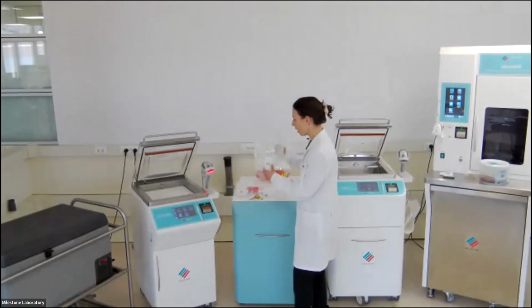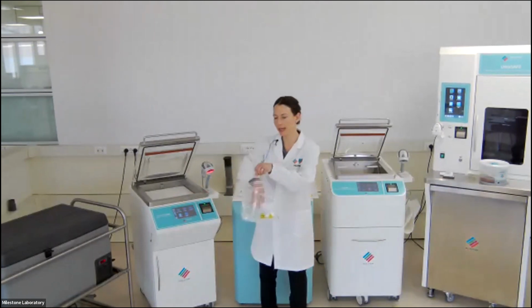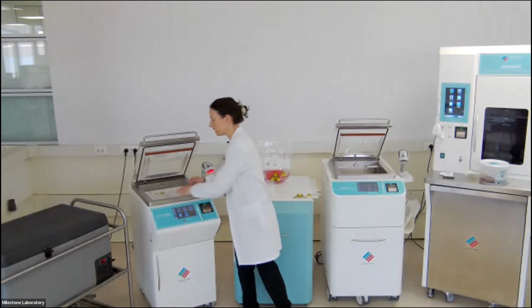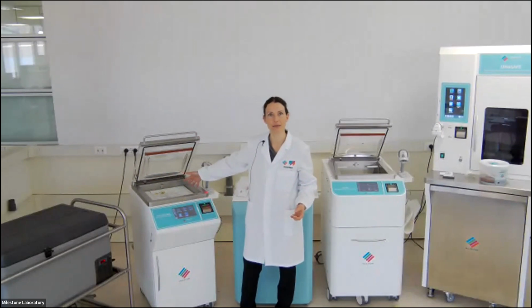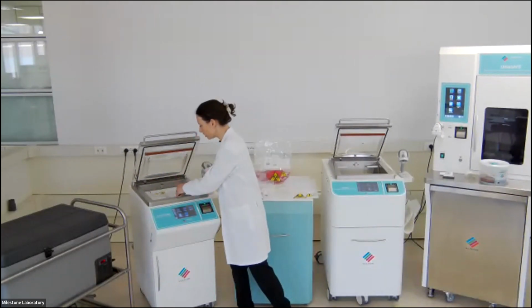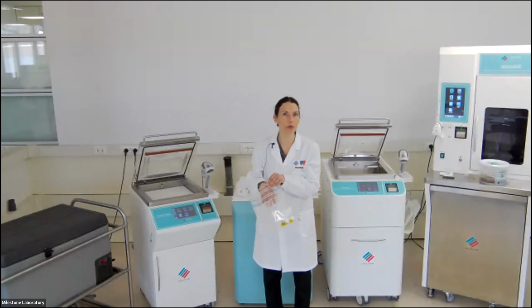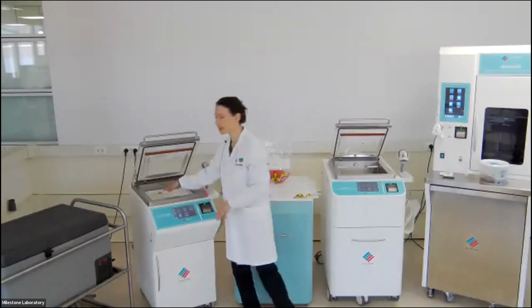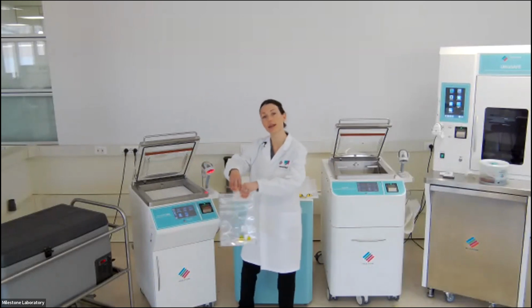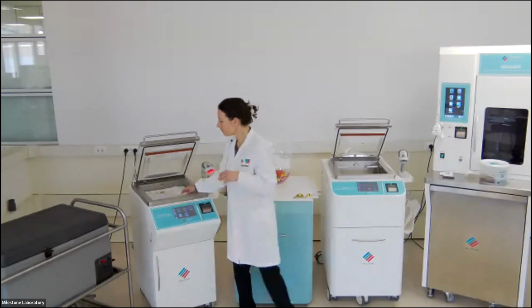What does it mean? Take the bag, tissue inside, the bag is positioned inside the cavity. How do we apply the vacuum? We remove the air from outside the cavity. So the vacuum is not direct on the tissue. This is very important because if you have some biological fluid, blood inside the bag, this liquid will stay safely inside the bag during the creation of the vacuum, because the vacuum is not direct and we don't extract the air from the bag.